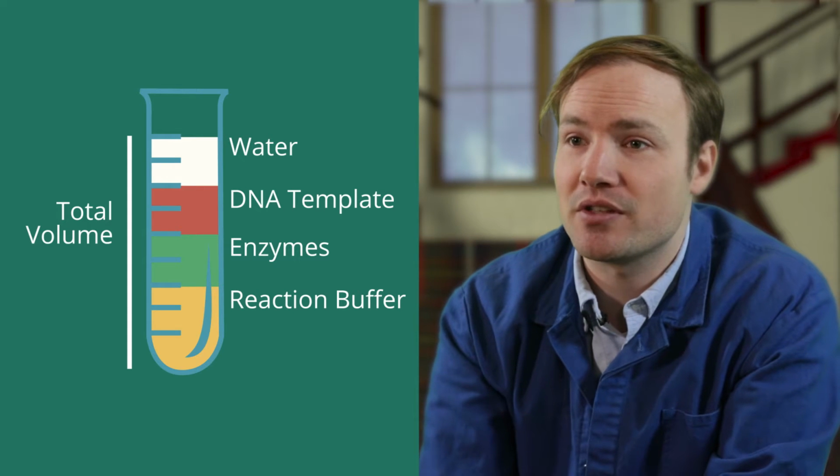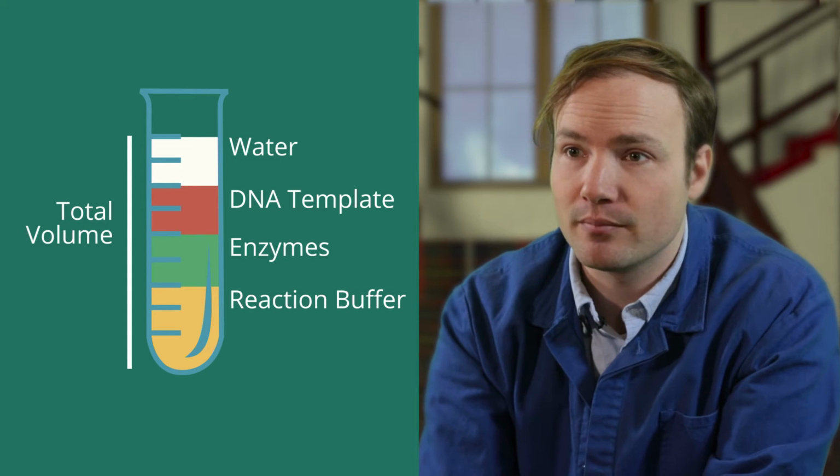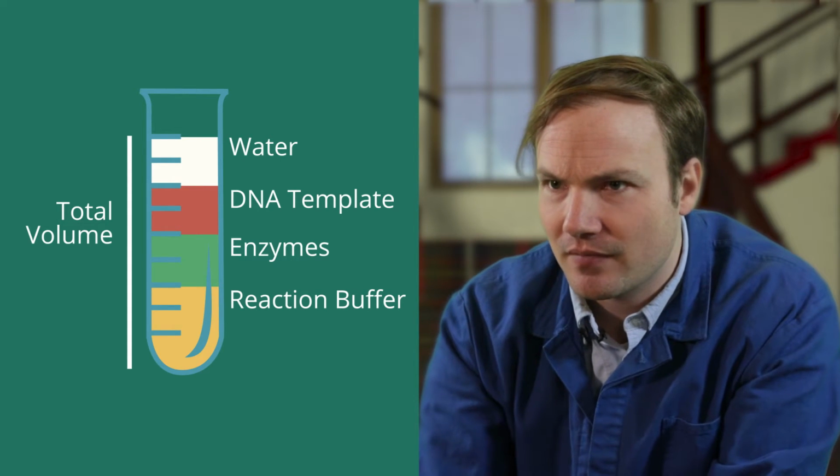We'll put our samples in a 37-degree incubator and we'll leave them there for an hour or more. But how long exactly? Well, we still have one more important question. How important is it that your reaction goes to completion? Do you really need to cut up every last piece of DNA, or is a little bit of uncut stuff okay?